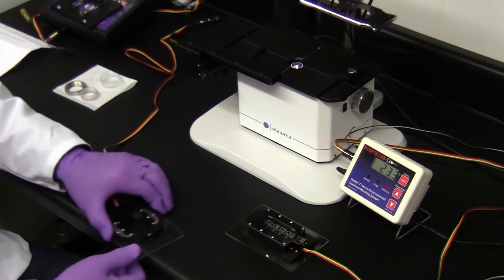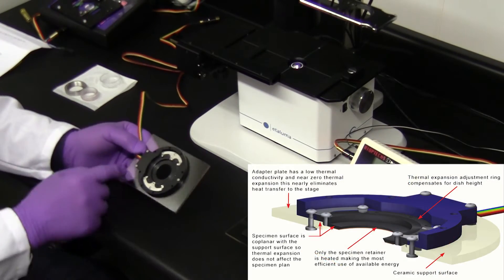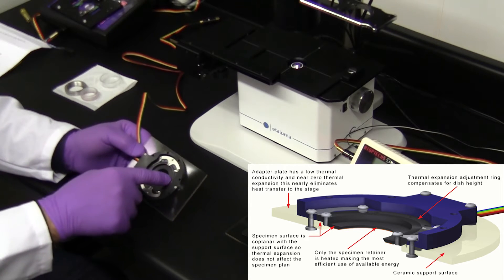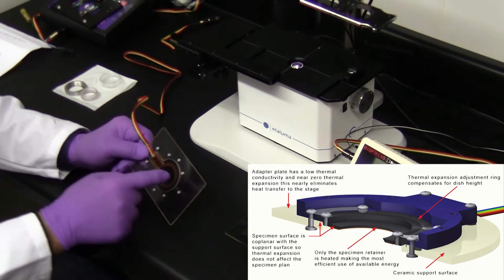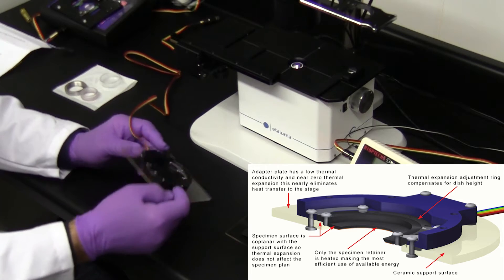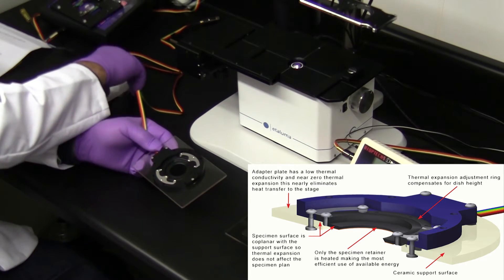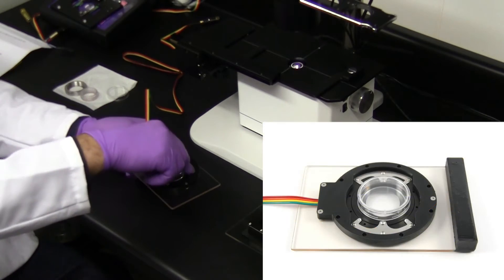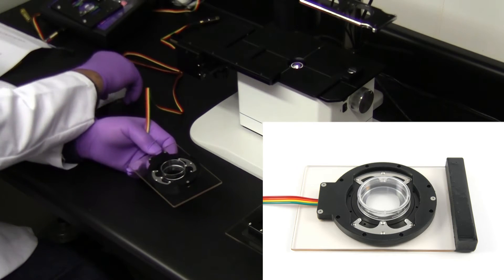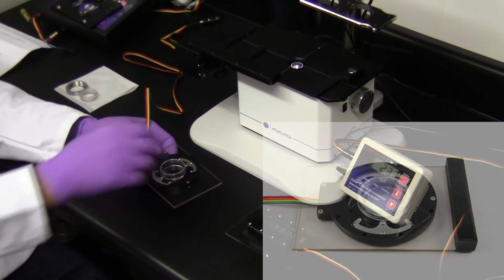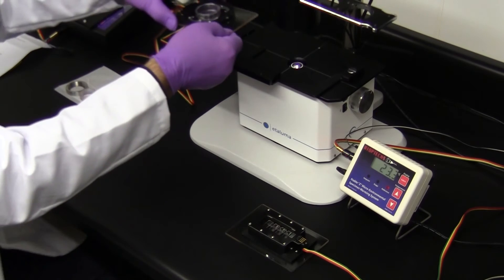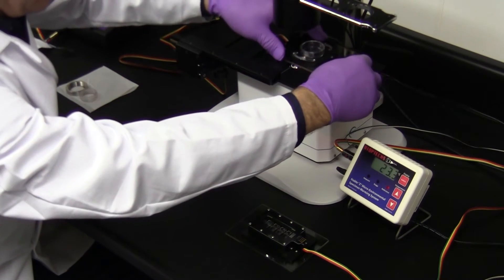Here I am demonstrating the stage adapter for a stable-Z specimen warmer. It is the only peripheral warmer that does not induce Z-axis drift to the specimen plane, an important feature for time-lapse imaging. It can be used with 35mm dishes, ICDs, and with the appropriate adapter, the Nunc Lab-Tec chamber slides.